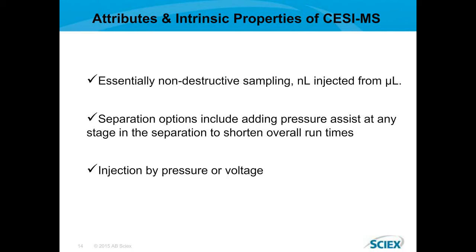A couple of other properties of CESI. It's essentially non-destructive in that you're injecting nanoliter quantities from microliter amounts. So basically, your factor is on the order of 1,000. You hardly use any sample at all.